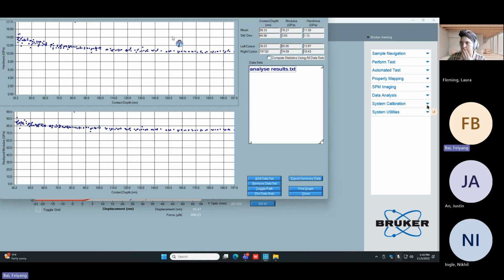Kevin is not here right now, so I'm looking after this. So it looks good. Only thing is that these are the outliers. One point is an outlier, and there is a small trend that we can see is not perfectly flat. Correct. And it's also not the expected values, right? I expect 69.6 for my modulus.